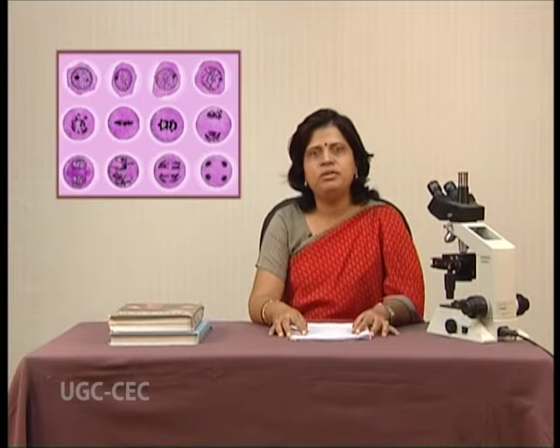To summarize, we have discussed the significance of meiosis and its various stages in today's program. We also performed the practical to observe the various stages from mice testes.